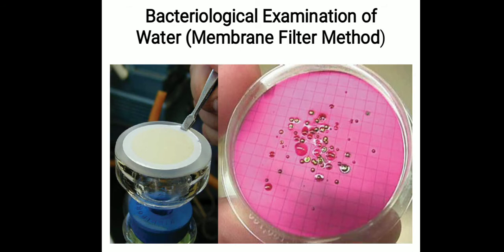The membrane filter method was first introduced in the late 1950s as an alternative to the most probable number, or MPN, procedure, another method for microbiological analysis of water samples.